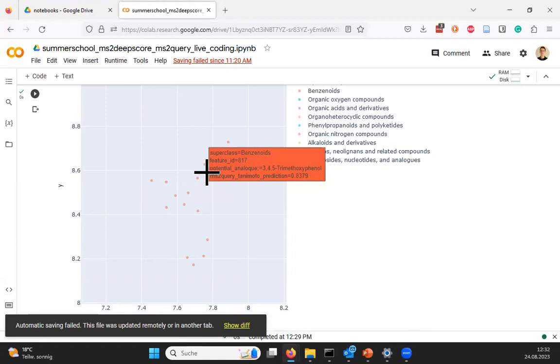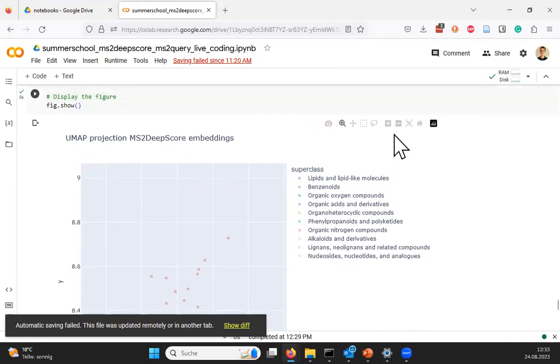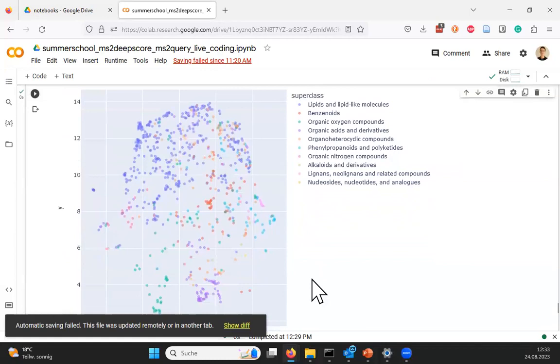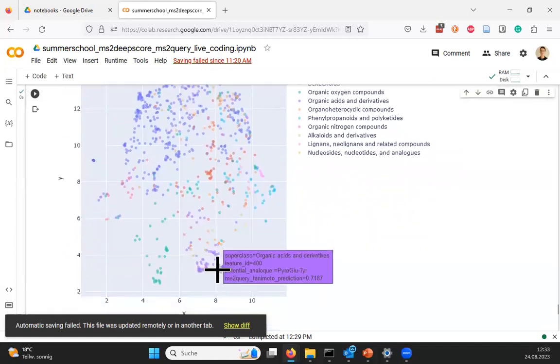I think that if you have any of this information, that would be useful, because what we do here is kind of walking blindfolded a bit, right? So we have no clue if these predictions are right. This is really only to get a first impression of, okay, somehow there seem to be certain patterns. Let me reset the axis here. We seem to have many hits for certain compounds, but before you call it anything close to an annotation, you have to do a lot of first steps.